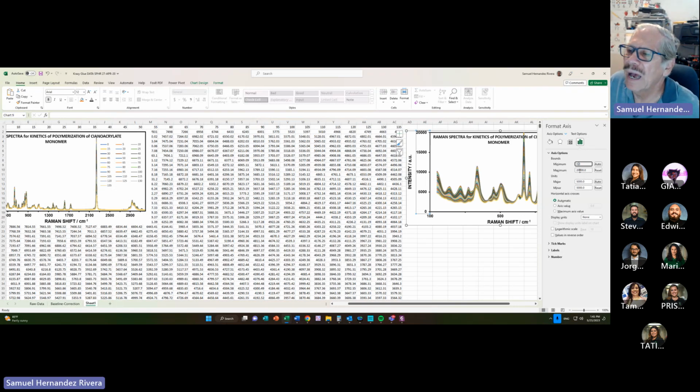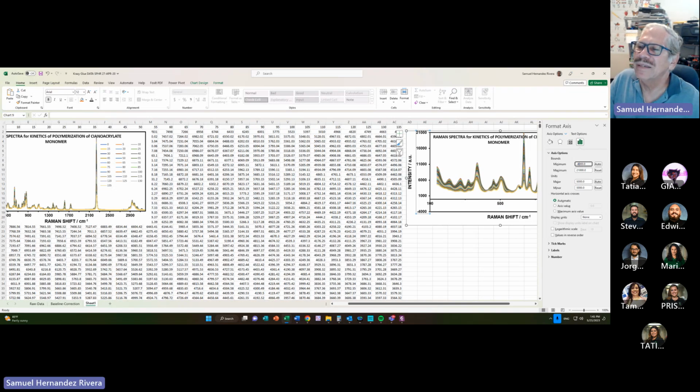So maybe I go to a maximum of 21,000. No, that didn't do it. And it messed up my y-axis. I didn't follow my own recipe.